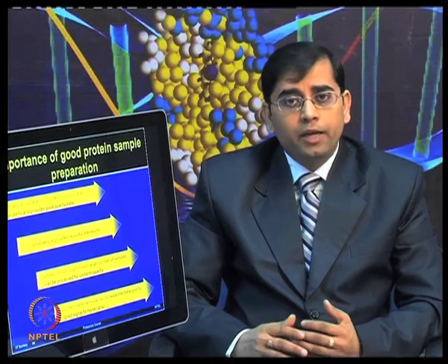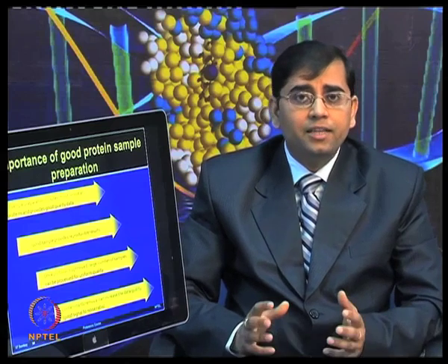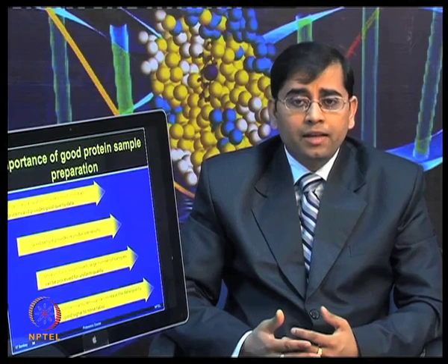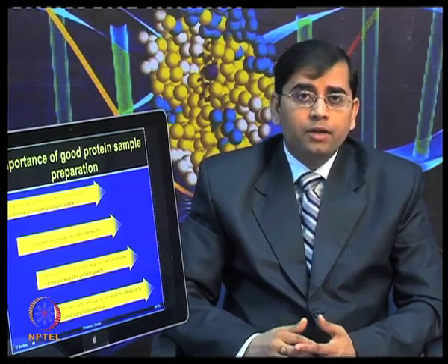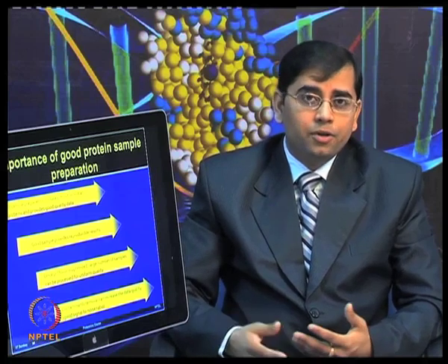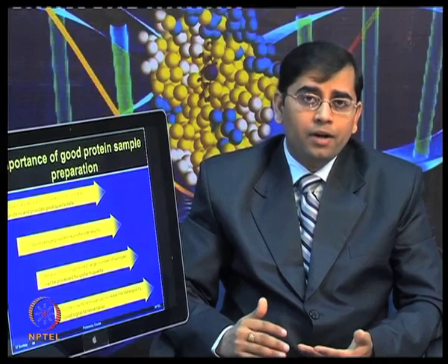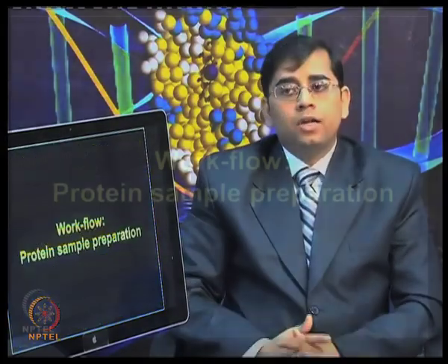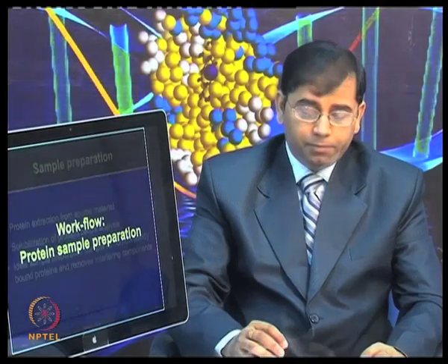Now, if you are able to remove a lot of contaminants or artifacts present in your sample, then your signal to noise ratio will improve. You have to literally see your good signal and do not have to worry too much about how to remove the background and the noise. So, I am giving you the workflow of protein sample preparation. Let us go step by step.